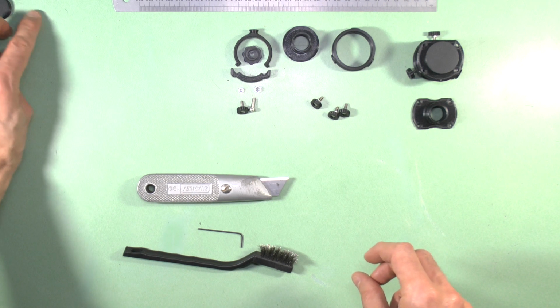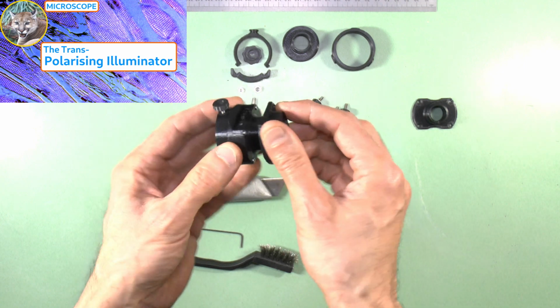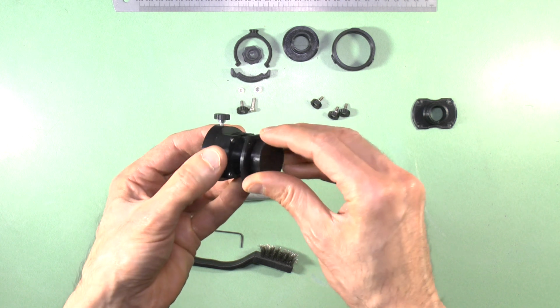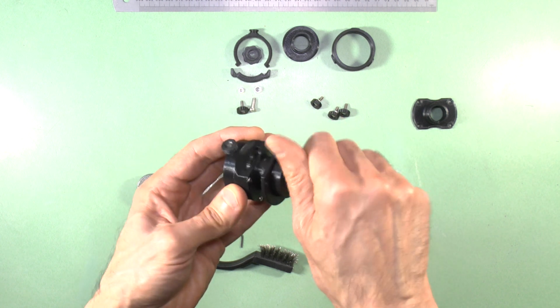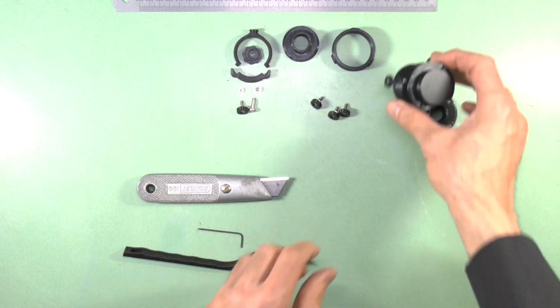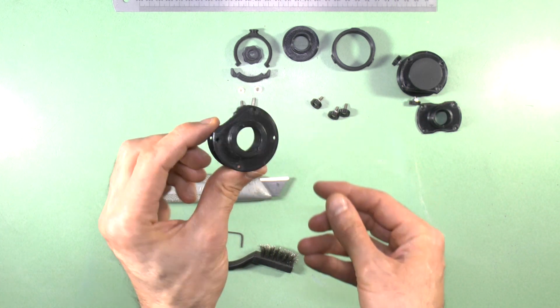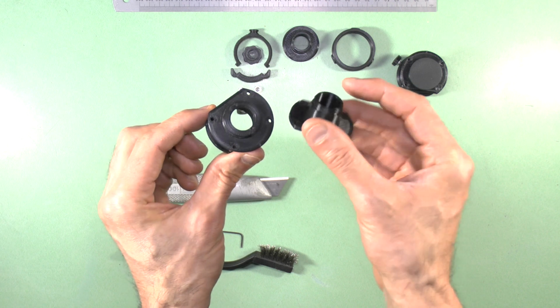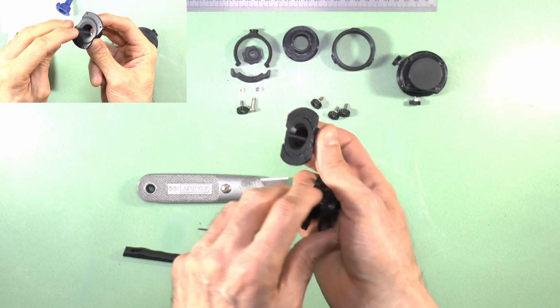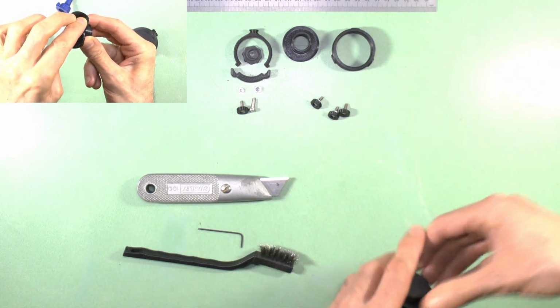You'll notice that I have here a complete polarizing condenser module. This was described fully in the video on the polarizing condenser, so I won't repeat those details. The reason I have this module is that the polarizing attachment for Epi-illumination is just the polarizing condenser with this top element, the pole-to-baseplate component, simply swapped out and replaced with this Epi-pole component. Just ensure you grease this aspect before fitting it, as was shown in the video for the polarizing condenser. And here is the finished product.